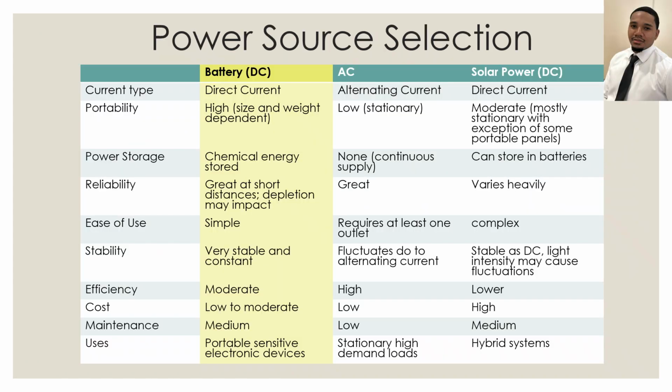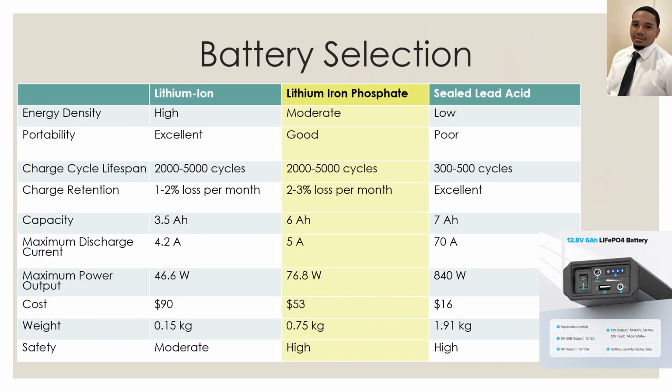Moving on to the electronics portion of our project, while each power source option had its own distinct advantages, the DC battery was chosen due to its reliability, cost efficiency, and portability it gives to the Raman spectrometer system. As far as the type of battery implemented, a lithium iron phosphate battery was selected in order to ensure a safe and stable output with high capacity and long lifespan. More specifically, a rechargeable battery pack was selected for simple integration.